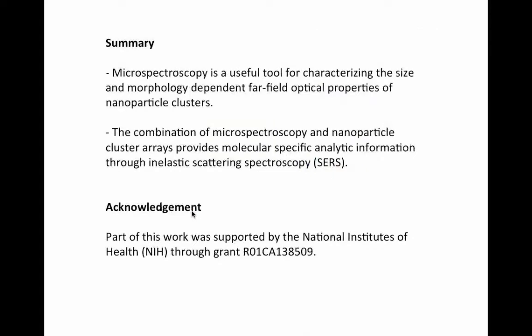So with this, I come to the end of my presentation, and I just want to summarize that microspectroscopy is a very useful tool for characterizing the size and morphology-dependent far-field properties of nanoparticle clusters. It's a very useful tool to fundamentally understand the physics underlying these new electromagnetic materials. And there are clear analytical applications. One of the analytical applications that I introduced here is the combination of microspectroscopy and nanoparticle cluster arrays to obtain molecular-specific analytical information through surface-enhanced Raman spectroscopy.